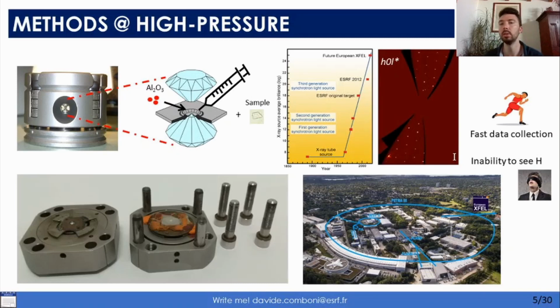Unfortunately, at high pressure, we don't see the hydrogen, but this is an inconvenience of a high pressure study, and we cannot do anything about that.